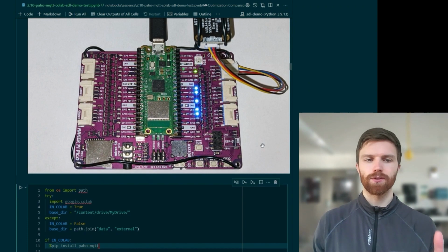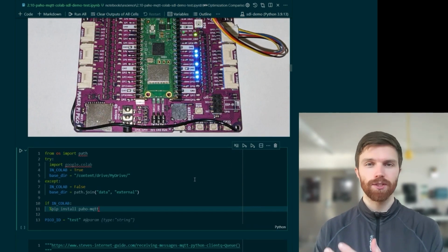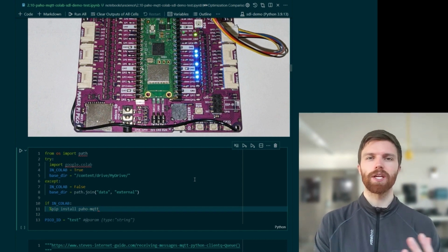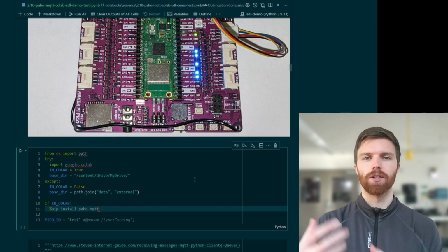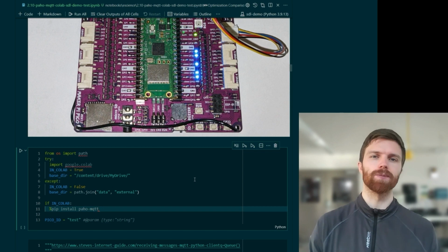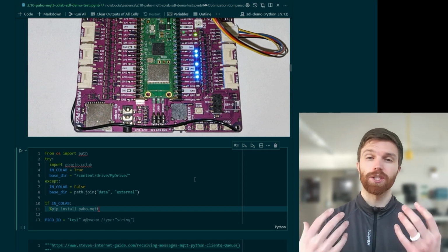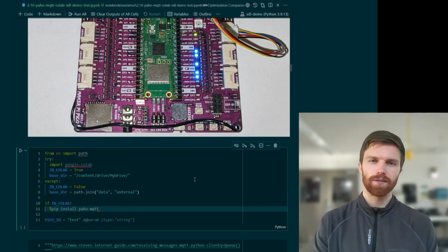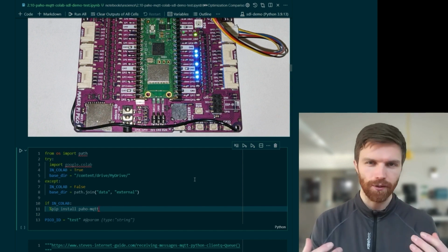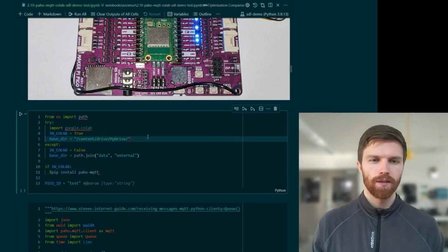we can go back to a Jupyter Notebook, and I'll show some of the lower level implementation here, as well as a package that I wrote that can serve as a template for writing up some of these communications between the microcontroller and Jupyter Notebook or Python script that you're running somewhere else, which could be on Google Colab, it could be on your machine. The main requirement just being that whatever machine you're running the code from is connected to the internet, as well as the microcontroller that's running the listening code.